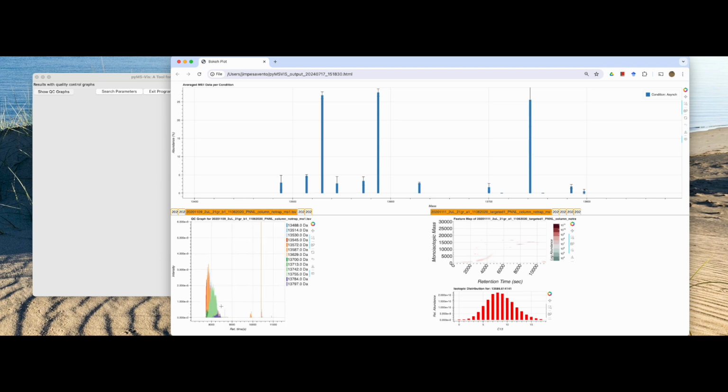If we zoom in on, say, this middle third data set, again, you have this cluster of masses that correspond to H2A, which I know because I've done this for decades. However, you have some other masses that met our search criteria and are added to the quantitation, but are not related. So these are artifactual, and you want to remove them in the next round.